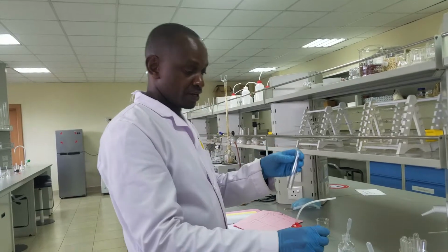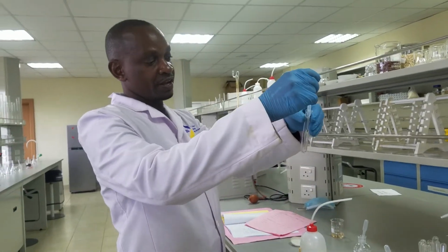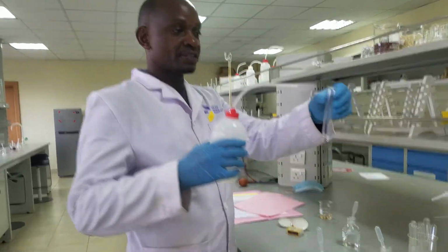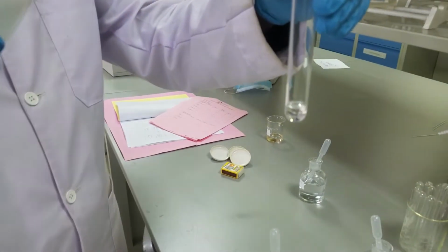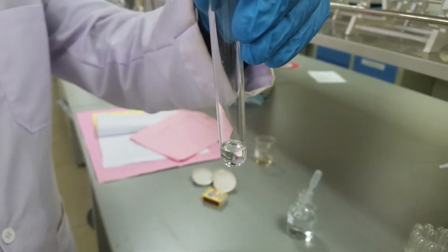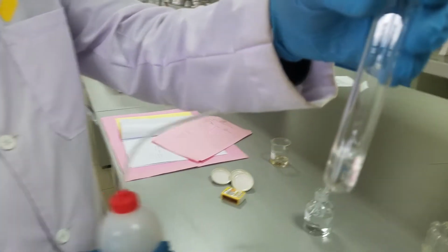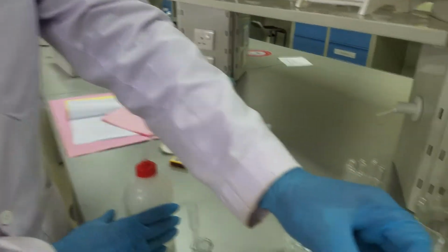So the second one is toluene, and again I'm using a similar amount, and you also add a similar amount of water like that. Not so much, but a similar amount like that. Are you able to see the difference?